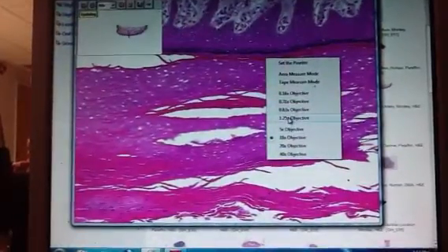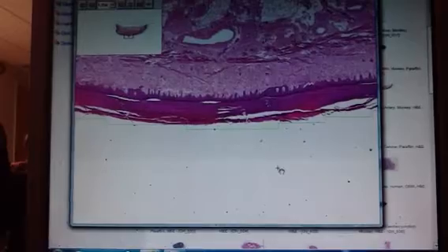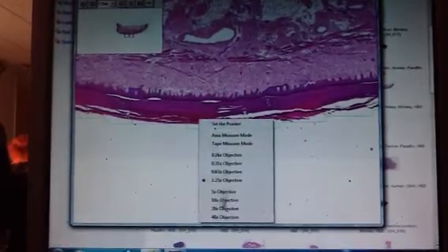Everybody see the difference between keratinized and non-keratinized? There are no nuclei. It doesn't matter about what's going on inside. It's what's the outermost layer. And remember, you can't just focus on one little individual spot because sometimes it cuts a little bit funky or it cuts different or whatever.